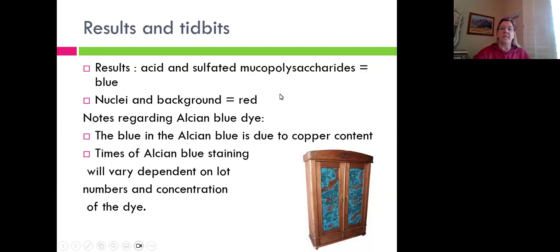So you can see these results are exactly the same, with the exception of the acids, because you're staining two, as with the 1.0. So microscopically, the pathologist can't tell the difference. Again, on this one you're staining 2, on the 1.0 you're staining 1, but microscopically your pathologist can't tell.